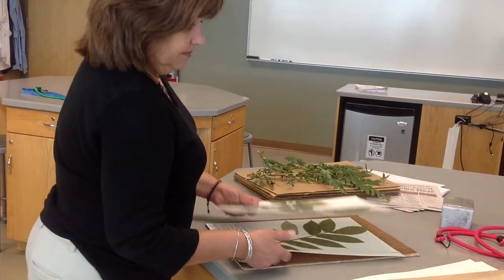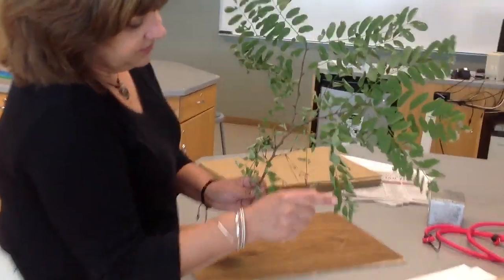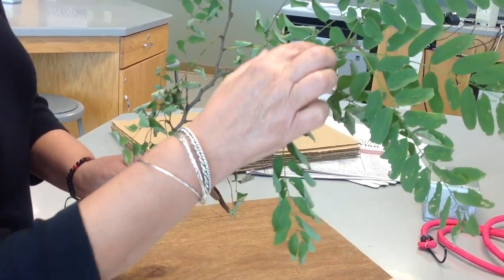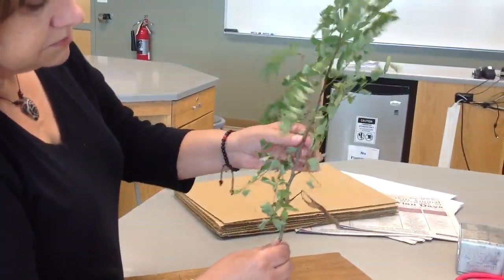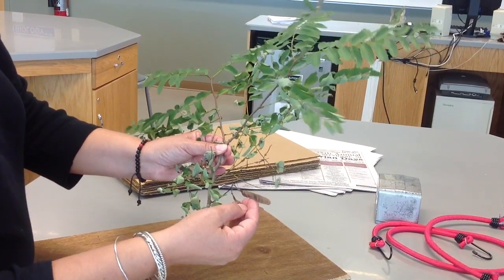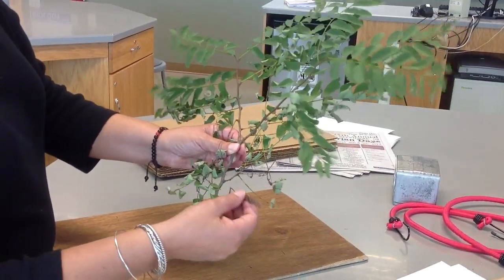I have a tree sample here that I collected. I know this is a compound leaf because I do not see a bud at the base of that blade — I'm not getting a bud until I make it all the way back to the stem. So this is, in fact, one whole leaf. I also want to try to preserve the fruits if possible — you can see we have a couple of seed pods here that contain the seeds for this plant.